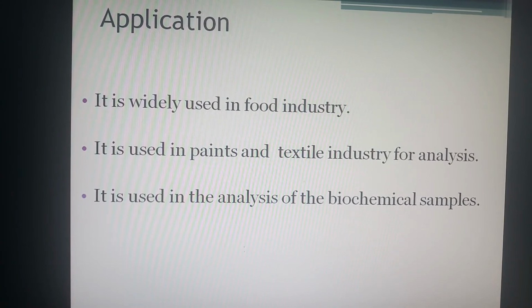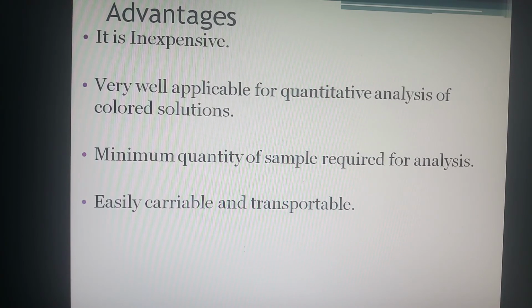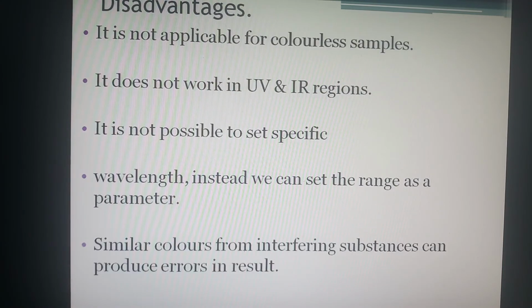Now the basic applications. It is widely used in the food industries, in paint and textile industries for analysis, and in the analysis of biochemical samples. Advantages: it is inexpensive and well applicable for the quantitative analysis of colored solutions, a minimum quantity of sample is required for the analysis, and its transportation and handling are easy.